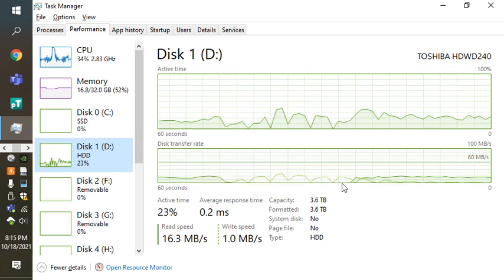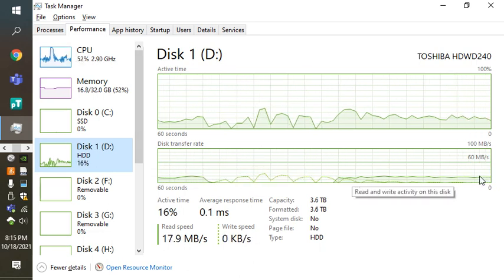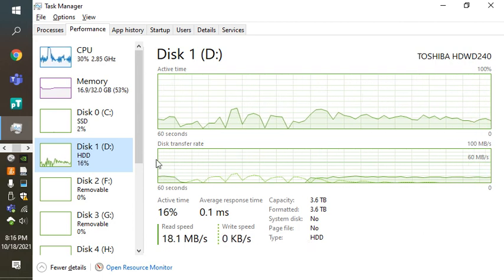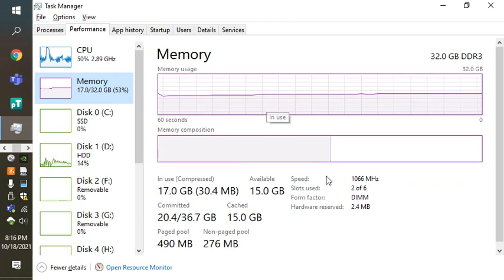The disk reading is happening more or less continuously as it reads all of these spectra into data structures in memory. I would note that although the memory shown in use by this particular Java job doesn't increase, it's more or less set aside a huge fraction of the system RAM to be used just in case. In this case, we don't see a huge climb in the amount of memory in use right now because the memory already expanded to accommodate all of the spectra that we were reading on the first file, and the later files are not really going to add much to that overall memory demand.